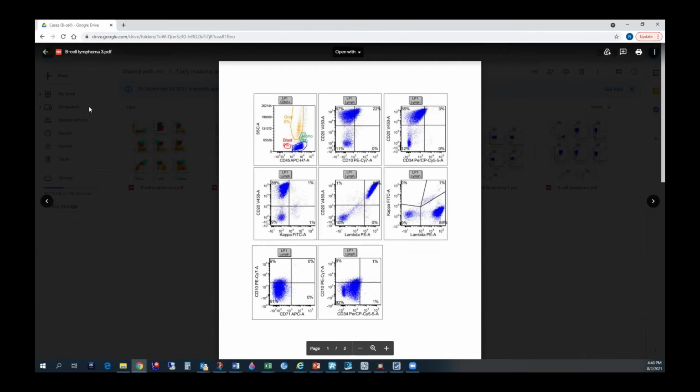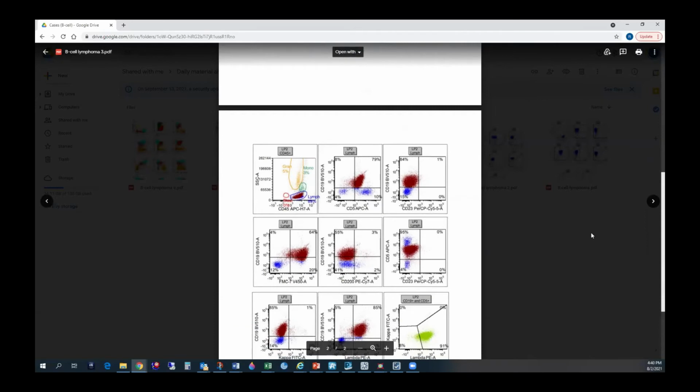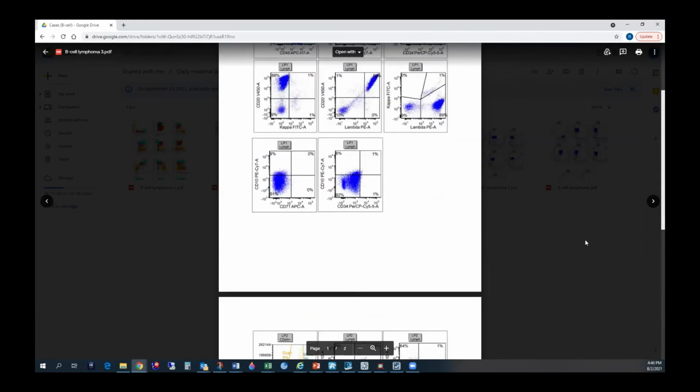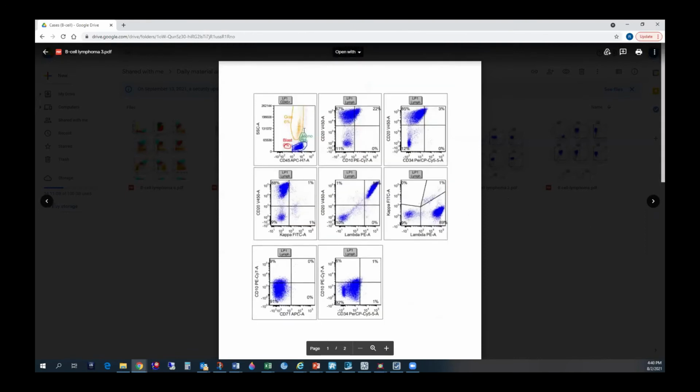Yeah. Got you. I have one question on this one with the bright CD20 and light chain very bright. I know CD5 doesn't go with it, but do you have concern with hairy cell on these ones? I know CD5 is usually negative in hairy cell, but would you do a panel for that, or you won't even go there because it is CD5 positive? One more thing is there are some monocytes here. Hairy cells will have a monocytopenia. I'm just throwing it there because I'll forget to mention it later.